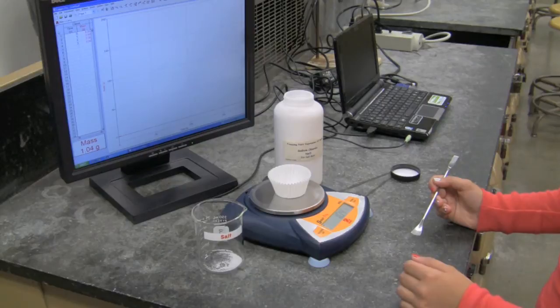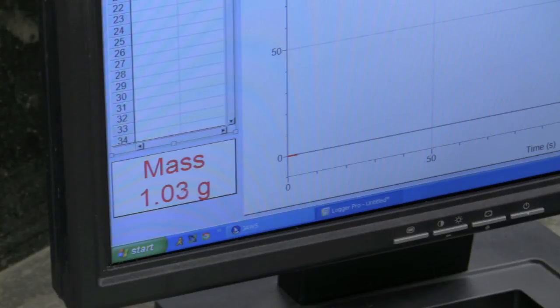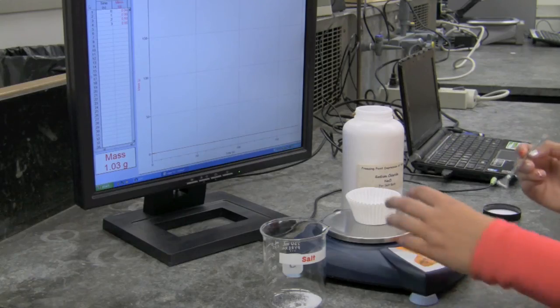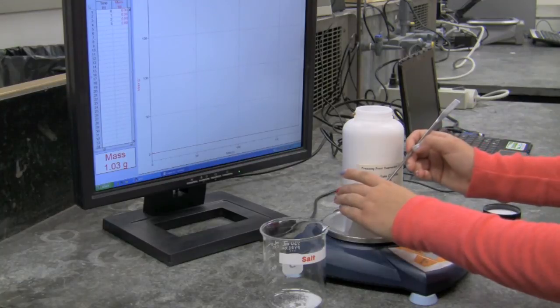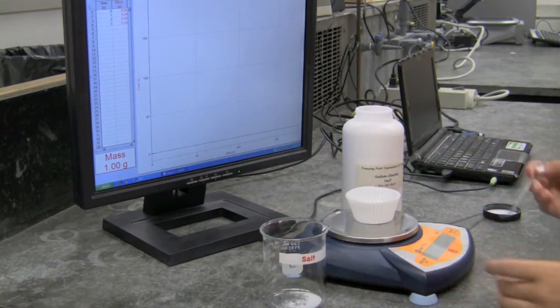1.04, 1.02. She is scooping excess salt from the weighing boat into the beaker one last time. 1.03, 1.00.